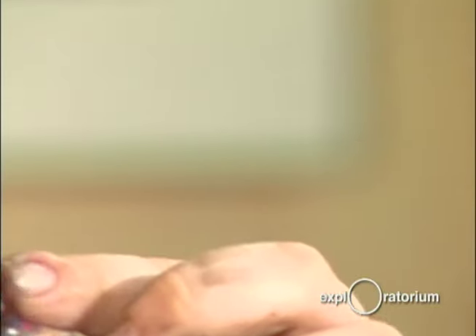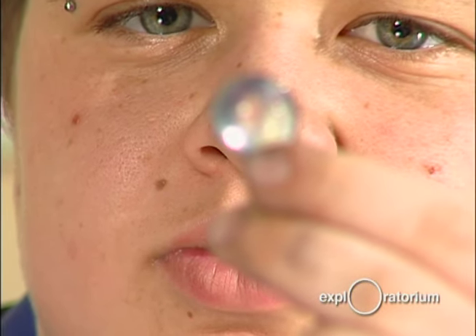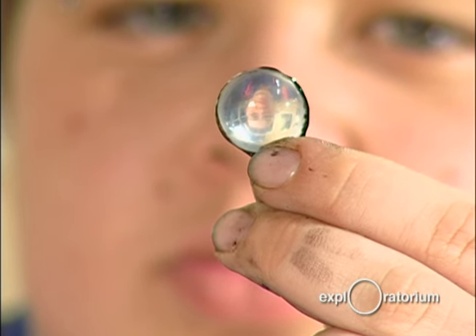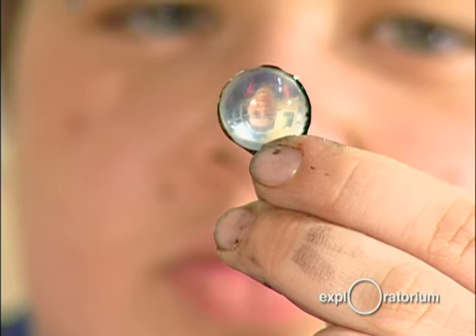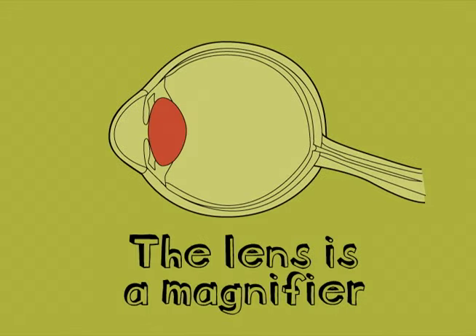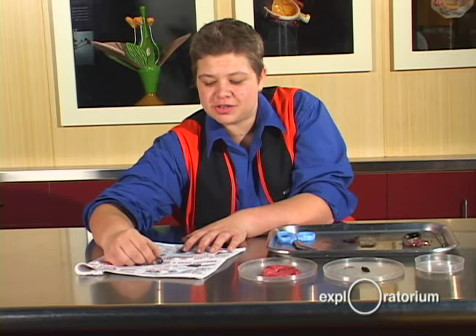If I hold the lens up, you can see me through it. Check this out — the lens acts like a magnifier.